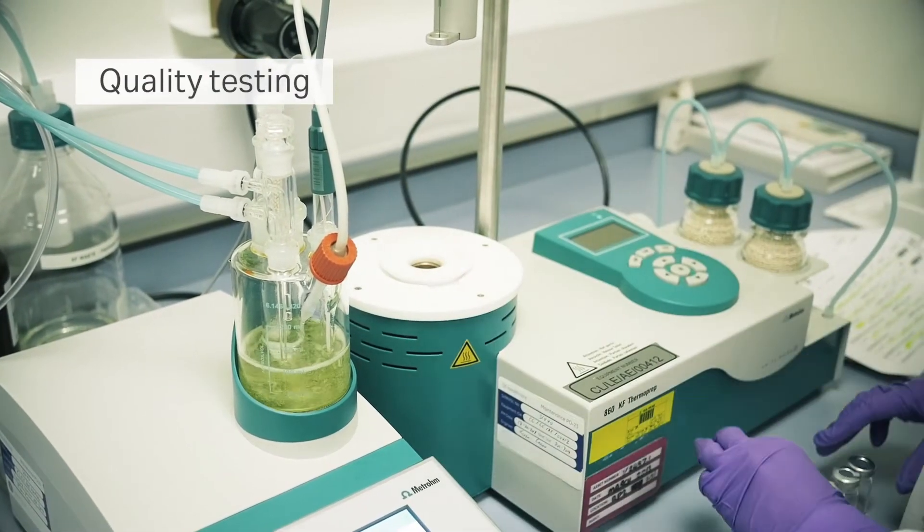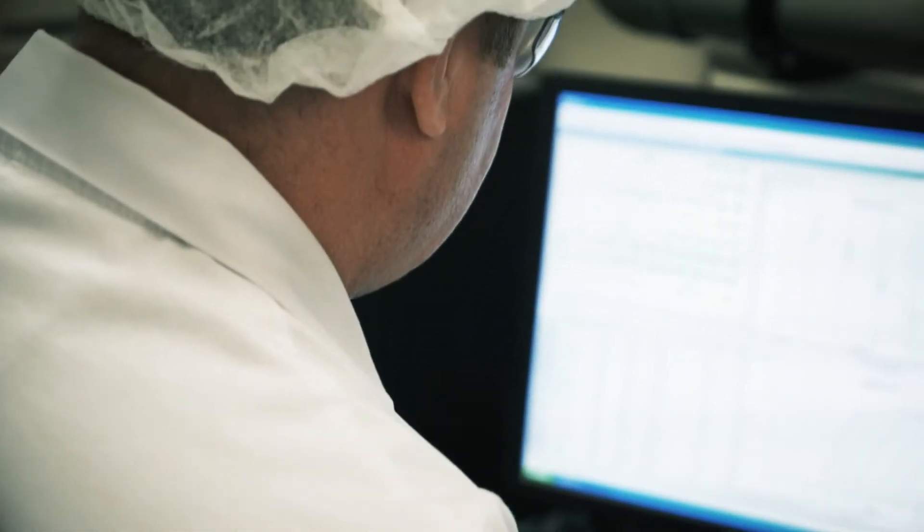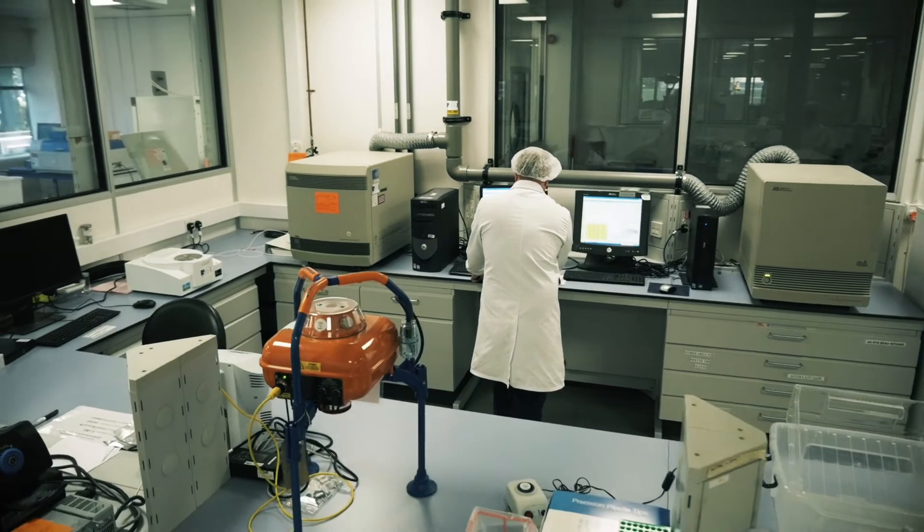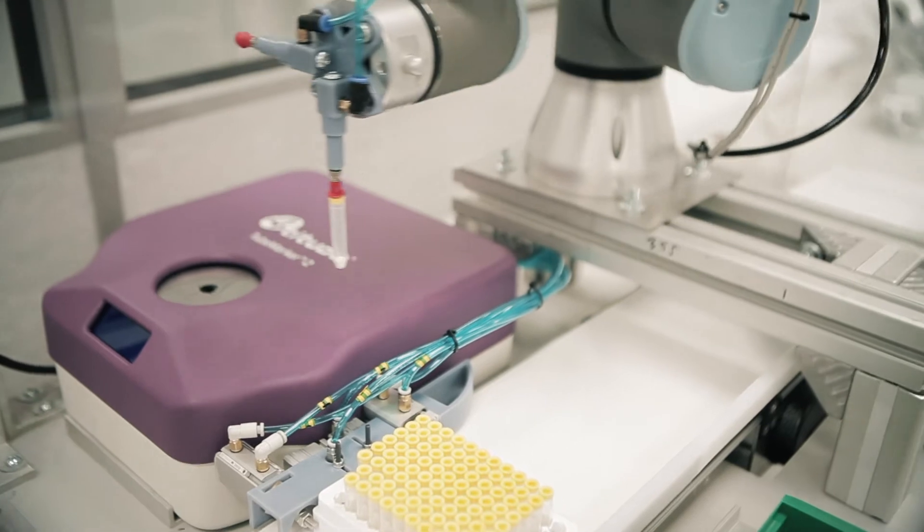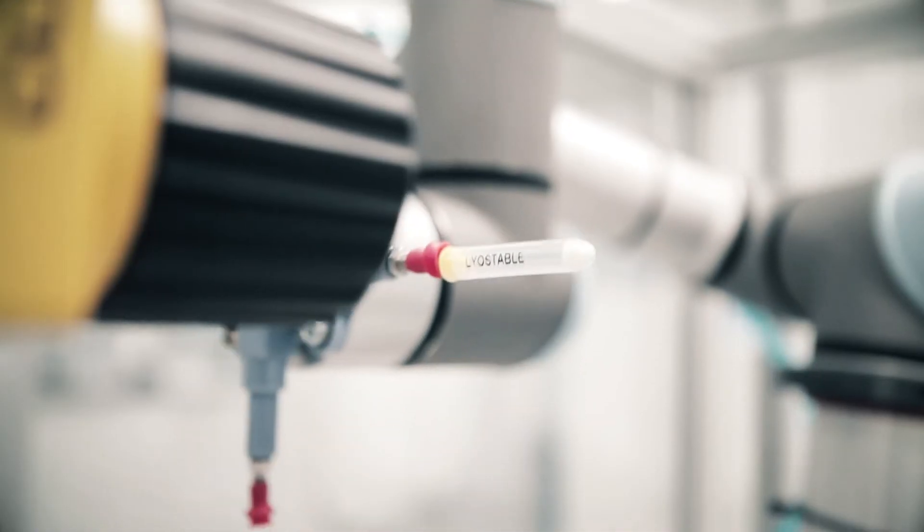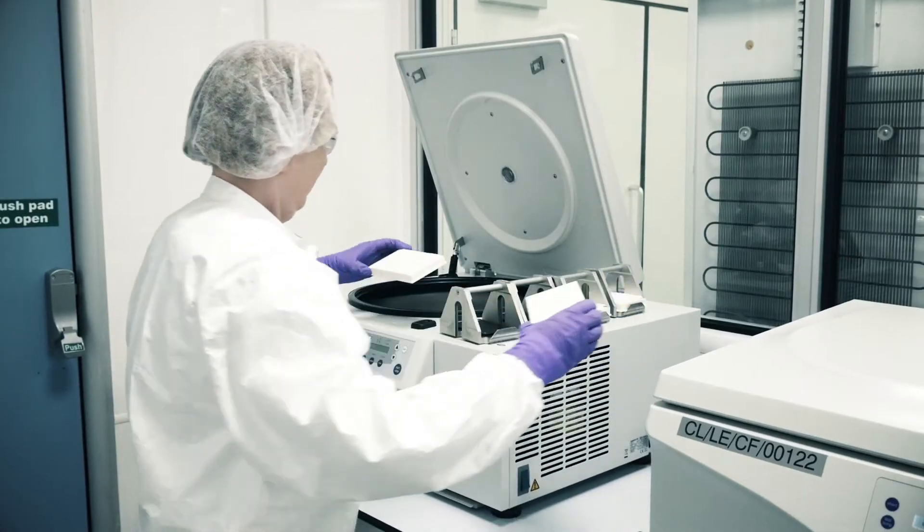We test for moisture content and TG onset or temperature transition. We can also perform qPCR functional testing if required. Our lean Six Sigma manufacturing methods ensure that every process step from raw material procurement to packaging and delivery is free from wasted effort and materials.